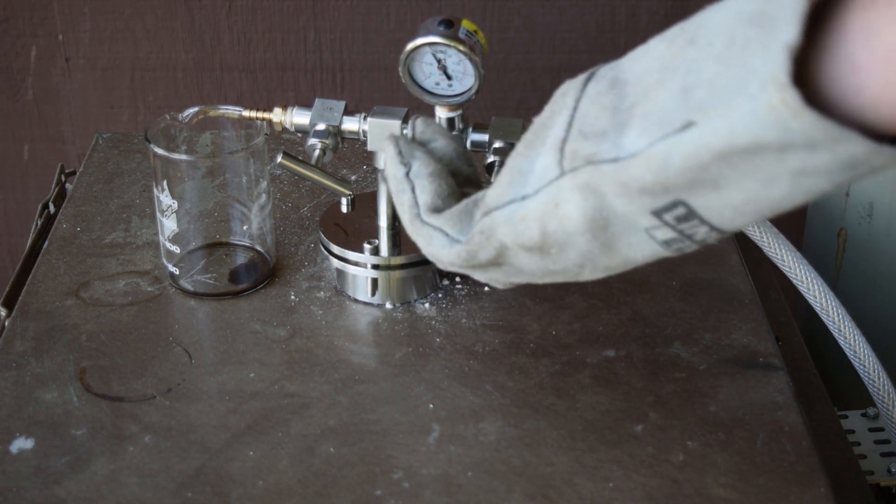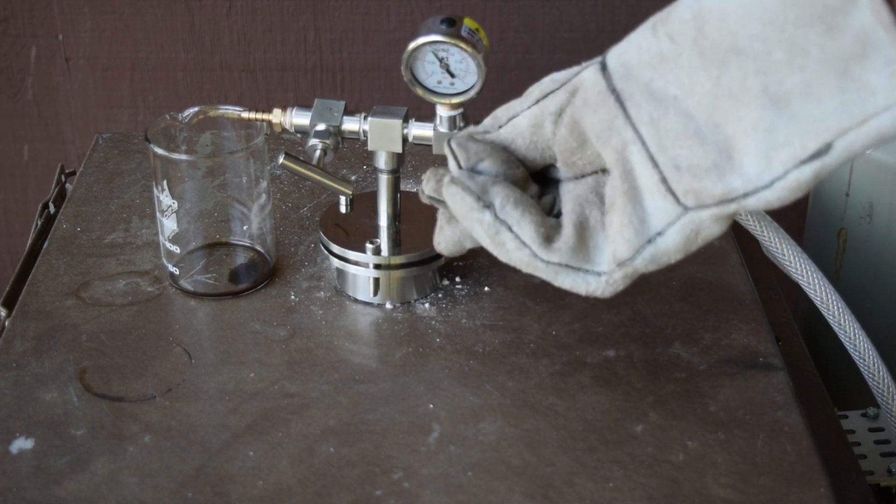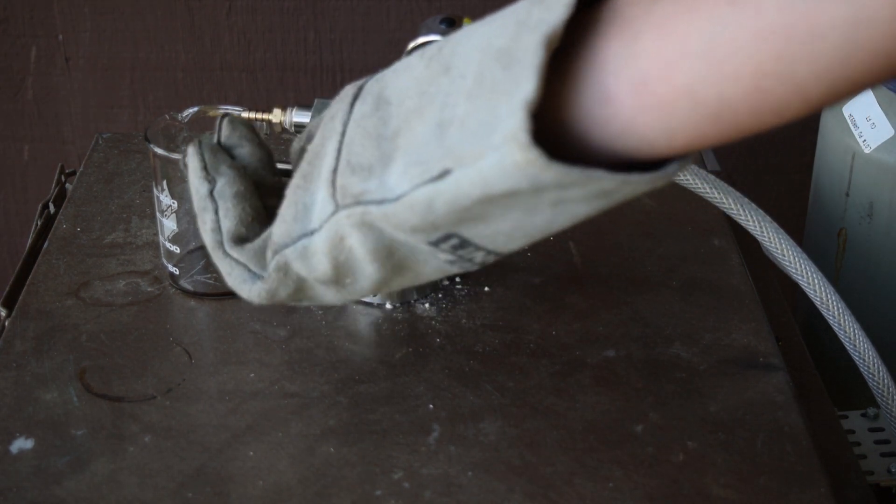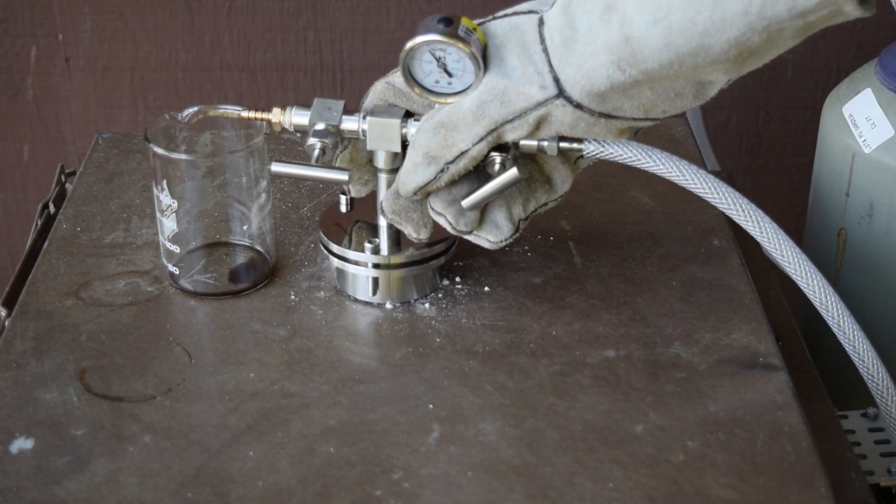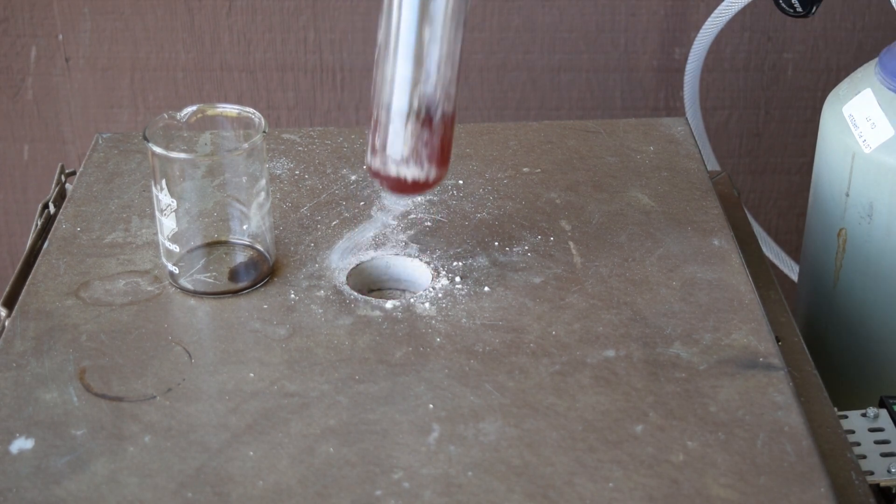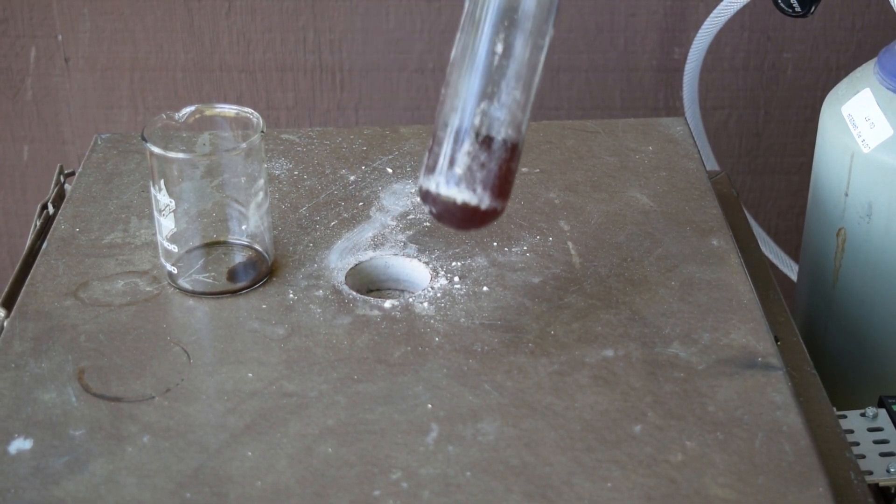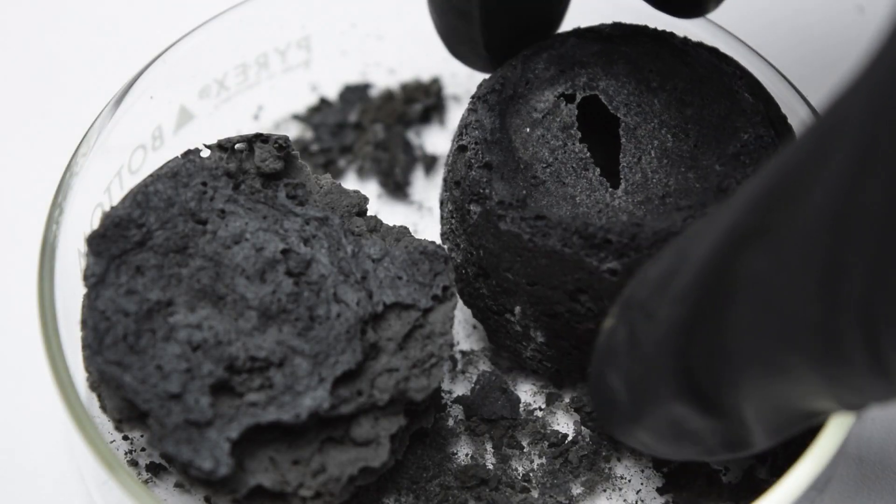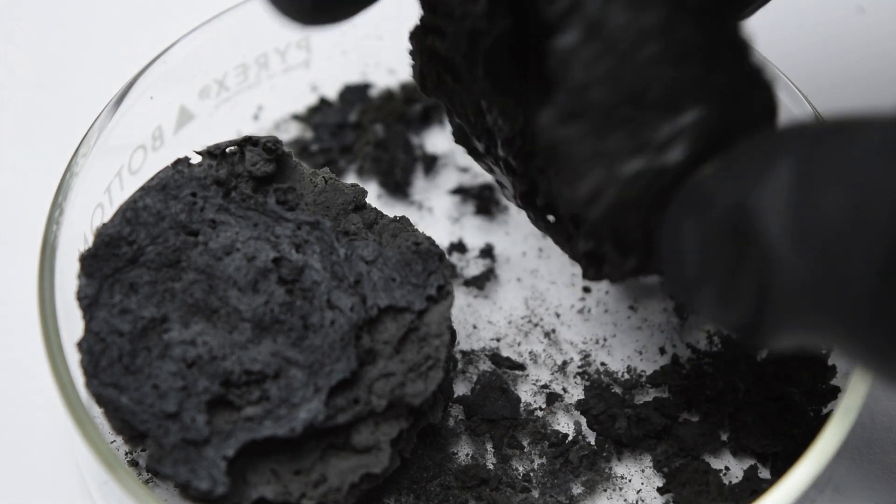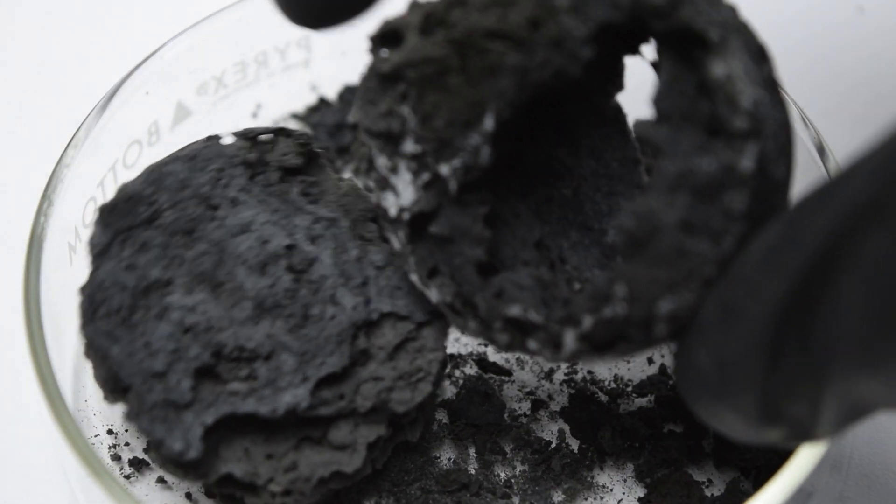After one hour, the argon flow is stopped and the chamber is removed from the kiln. The final carbon is clumped into large pieces, which will need to be washed with 10% hydrochloric acid and deionized water.